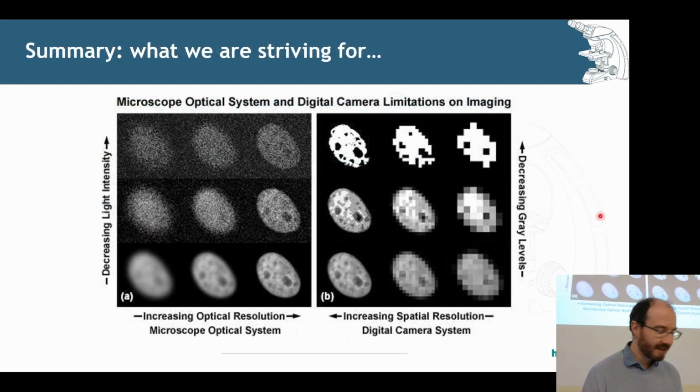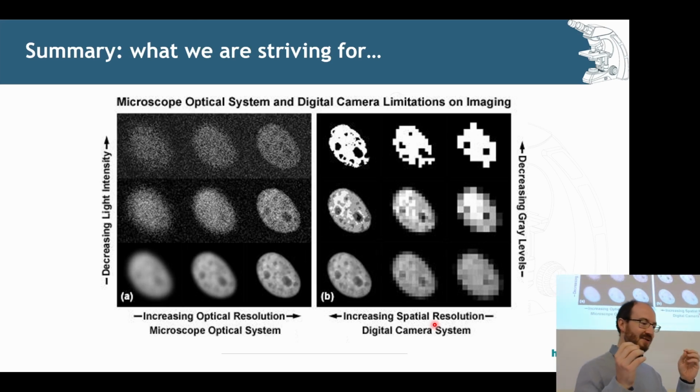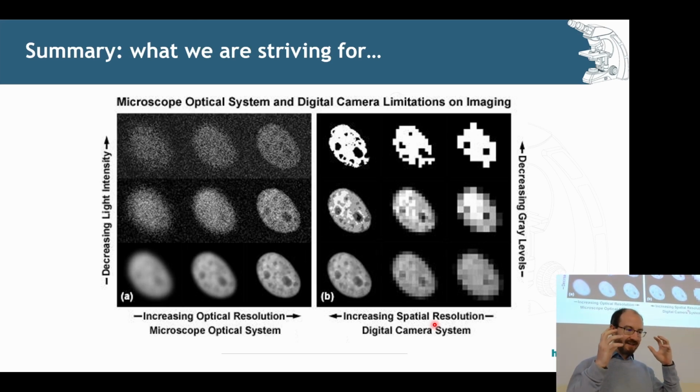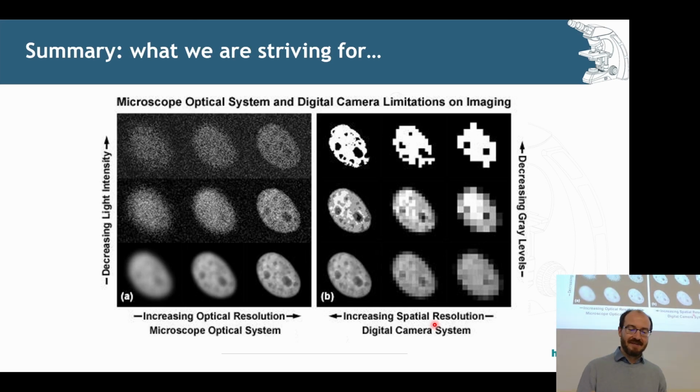So then in summary, and I think this might be a good place to just have a quick break, there are a lot of things that we're trying to balance when we acquire samples, which will ultimately lead into the analysis. And I haven't said this explicitly before, but it's very important that you set up your acquisition parameters with the intent that I'm going to analyze these samples.